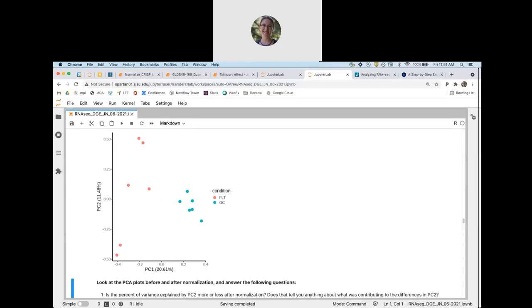Zinru, what do you mean by outliers exactly? Because the variance in PC2 decreased, I'm not sure. Okay, let me tell you how I think through this, and then maybe it'll become a little bit more clear.